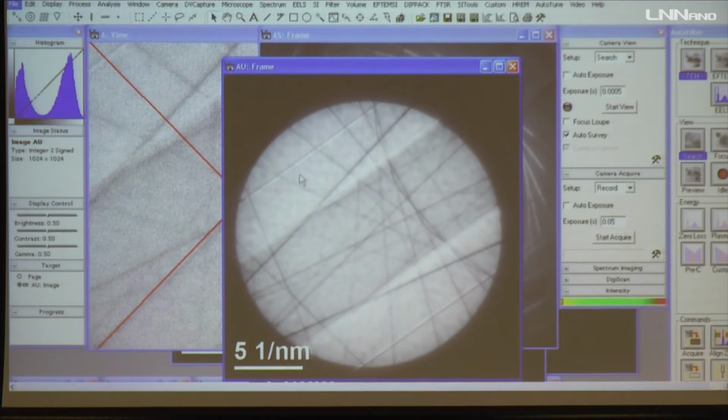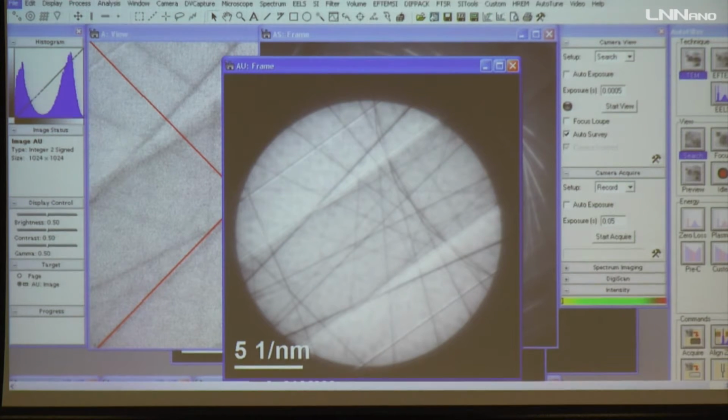These lines are related to the crystal lattice and also to the accelerating voltage. We need to calibrate these lines: what is the exact accelerating voltage of your experiment on that day? And further, you need to understand the strain using these lines. During my Monday presentation, I'll try to show you how these lines are related to the accelerating voltage and crystal lattice. That's strain analysis. I'll show you that one.